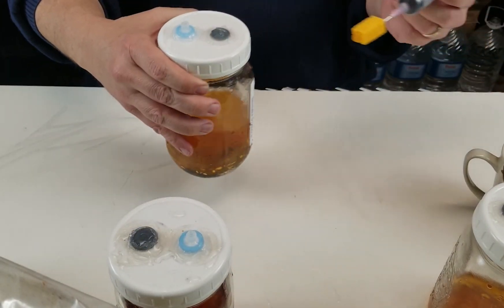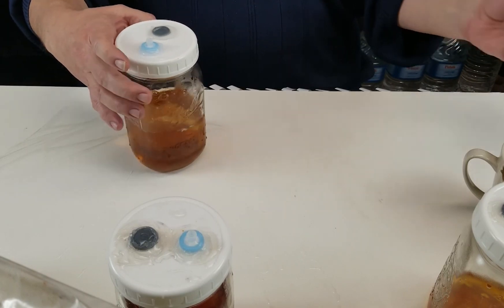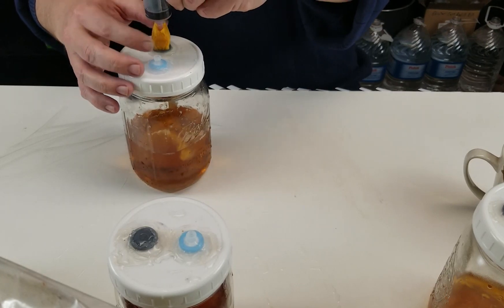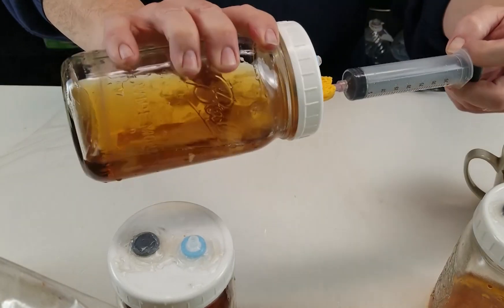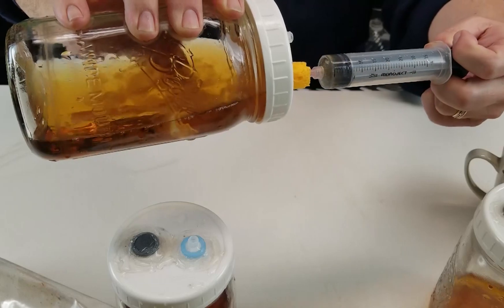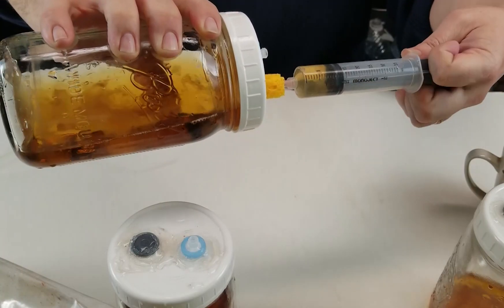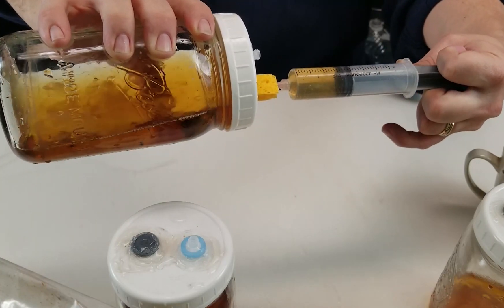We're going to go ahead and start by grabbing some of our liquid mycelium from a jar. We'll clean off the injection port, and we'll go ahead and make a withdrawal. Sometimes you have to kind of work it back and forth in order to be able to get the mycelium out of the port. The mycelium tends to clump up naturally, but giving it a few swirls usually breaks it up enough to grab an injection out of it. You can use a stir bar as well.